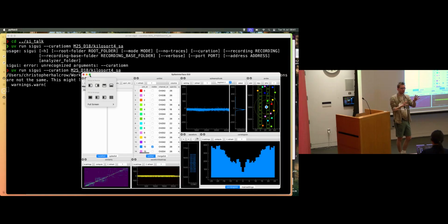And you do it with many sorters, and then different ways that the graph can combine suggests this is a merge or this is a split. And then it does a consensus sorting based on that kind of thing. It's a little bit of work to get going, but it's very cool once it's going. But for doing multiple sorters, okay, yeah, this is one at a time.